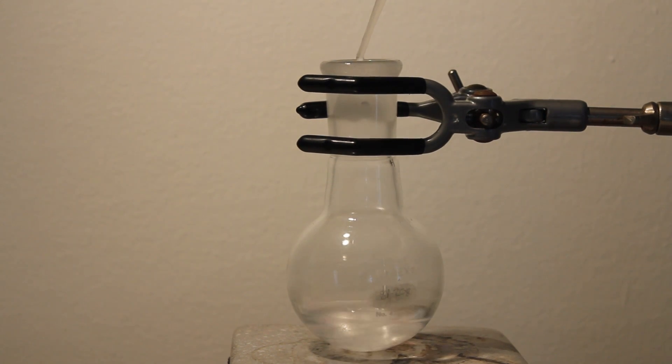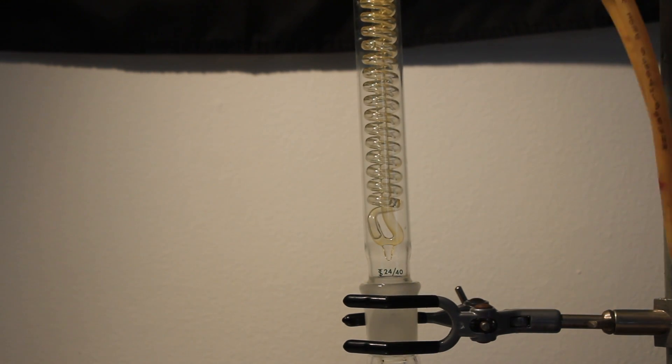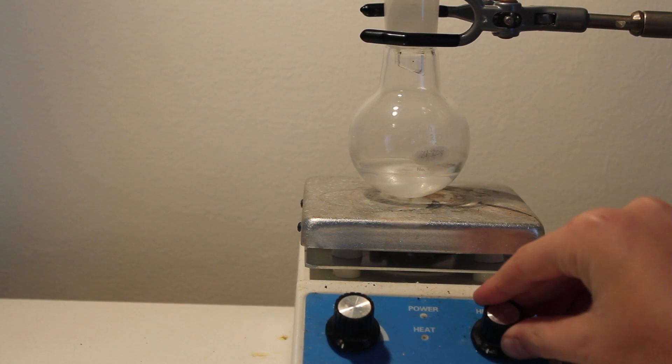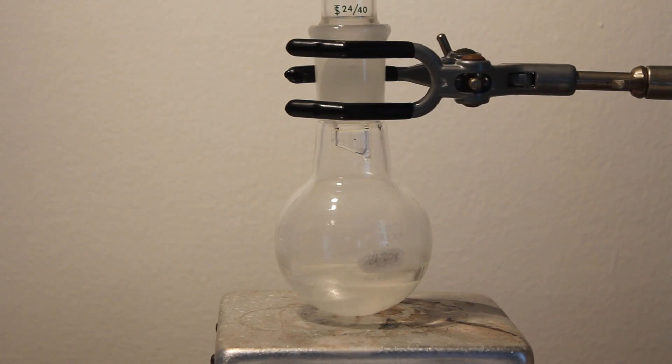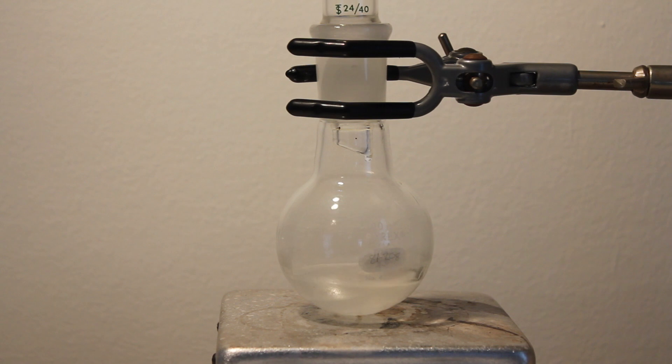Then add 1 milliliter of concentrated sulfuric acid. Attach a reflux condenser, then turn the hot plate on medium heat. Note the time when the mixture starts refluxing.